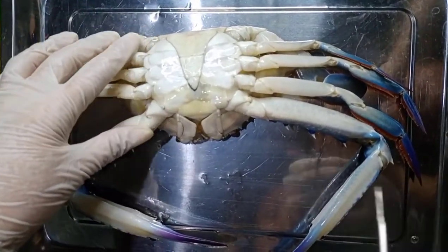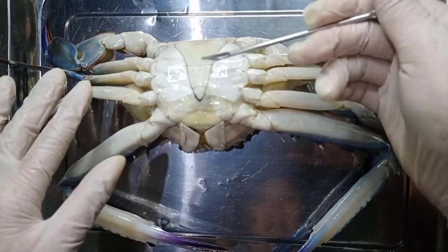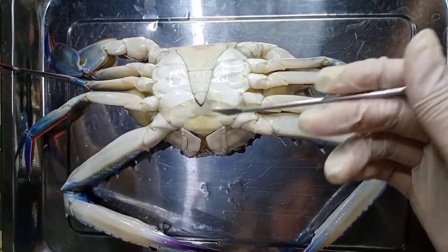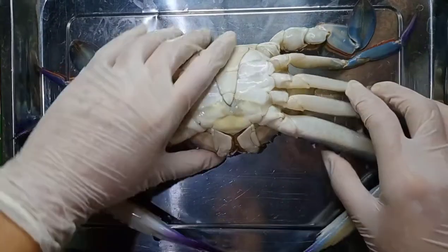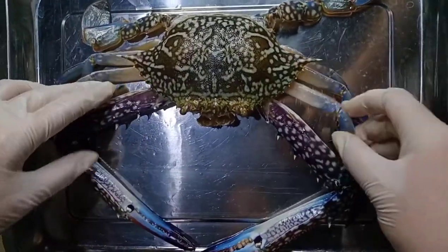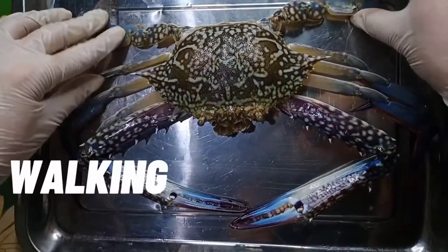My crab is a male, since it has a narrow and T-shaped apron here. As we all know, a female crab has a more rounded and broad apron. It also has five pairs of jointed appendages, one of which is called the cheliped, and the other four pairs are the walking legs.